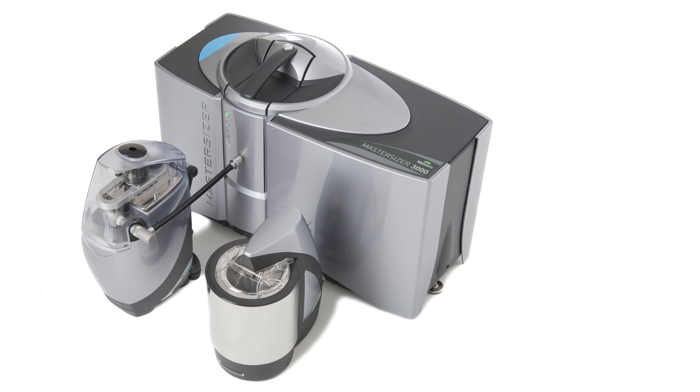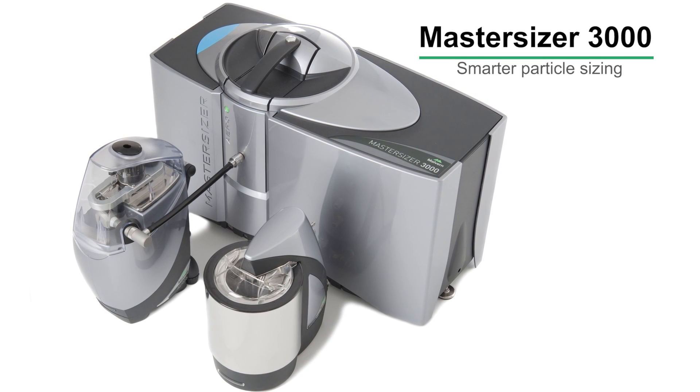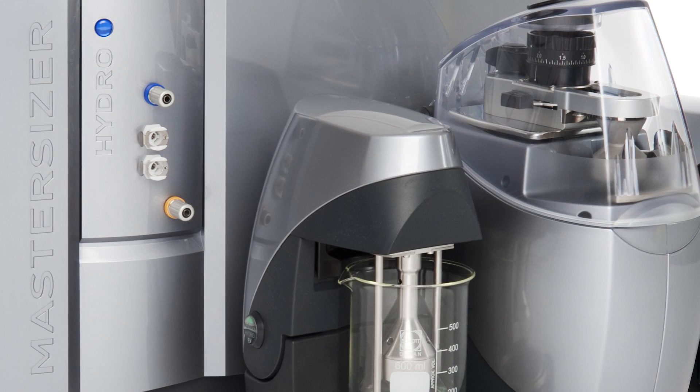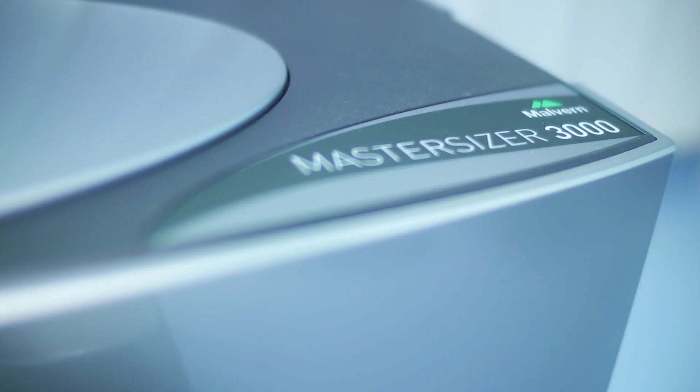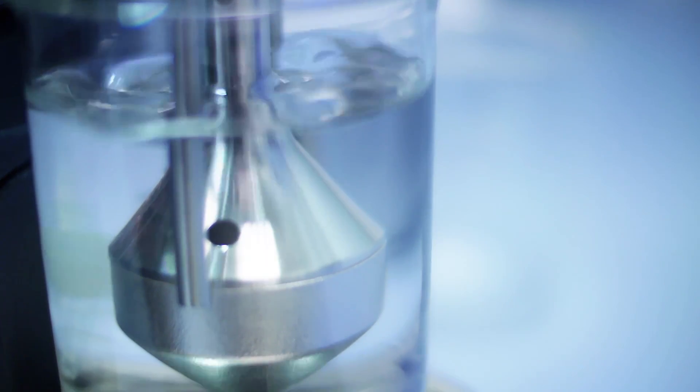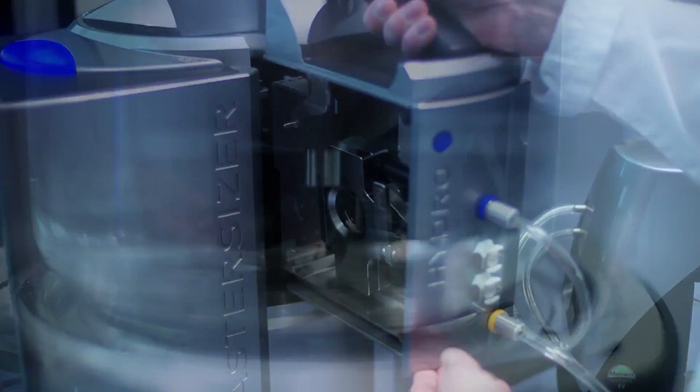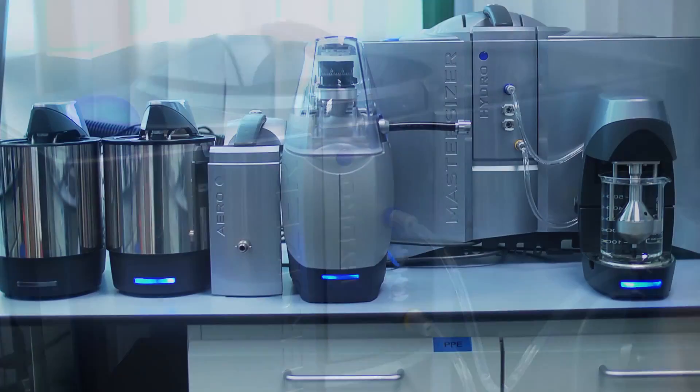The Master Sizer 3000 is the world's leading laser diffraction particle size analyzer. It has been developed not only to enable robust and rapid particle size measurements over a wide 0.01 to 3,500 micron range, but also to bring Malvern's application knowledge and expertise right next to you in the lab, enabling you to develop and run your methods efficiently.